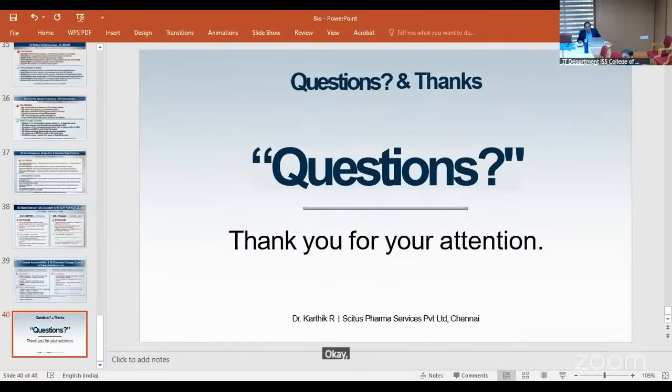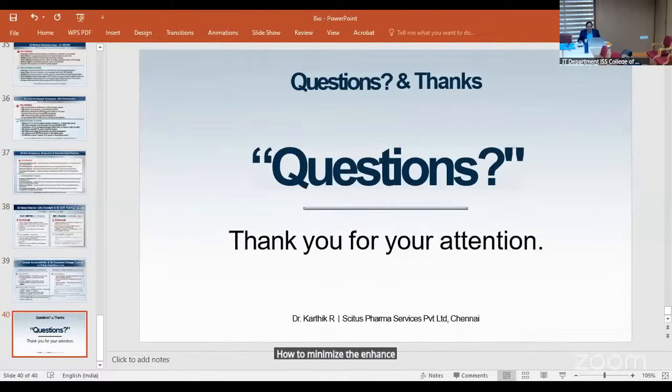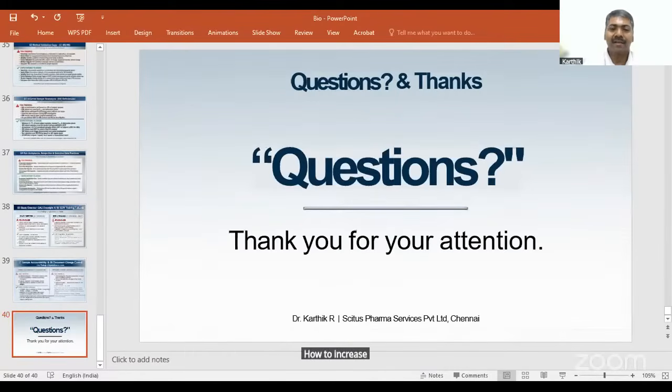Okay, thank you, sir. One question from the chat box, from Aditya Bogar. How to minimize the enhancement for analyte and internal standard response? How to increase the enhancement of analyte? How to increase the analyte response?